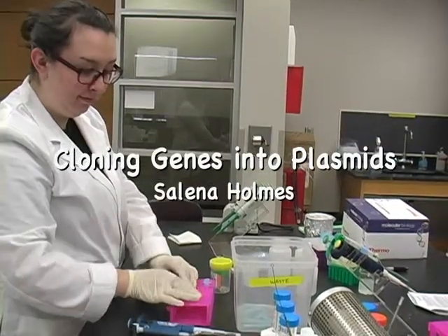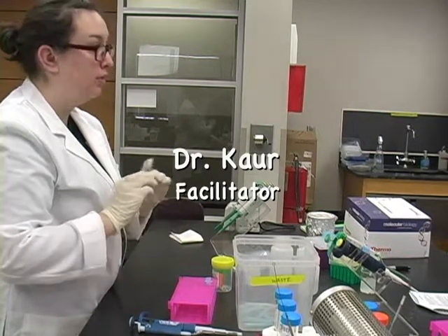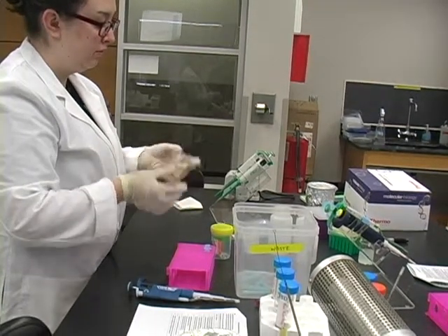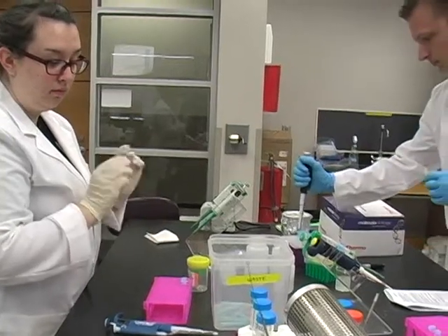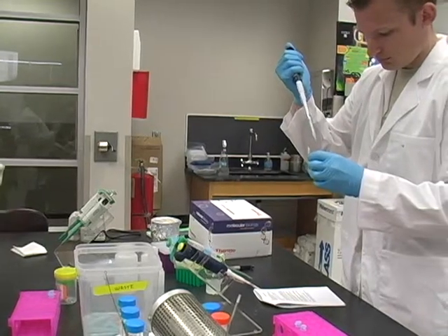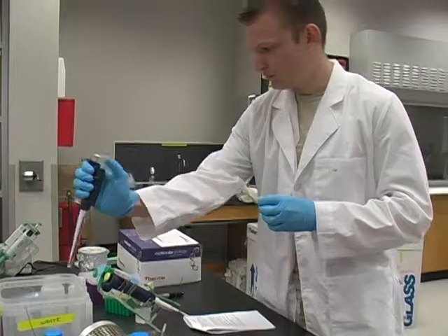The students are isolating plasmid DNA. The plasmid is going to be used to clone a gene into it, so the very first thing we're going to do is take the bacteria cell that contains the plasmid and isolate the plasmid DNA from the genomic DNA. To make sure that they have the plasmid DNA, they're going to run it on an agarose gel to verify that they have isolated the plasmid DNA from the genomic DNA.